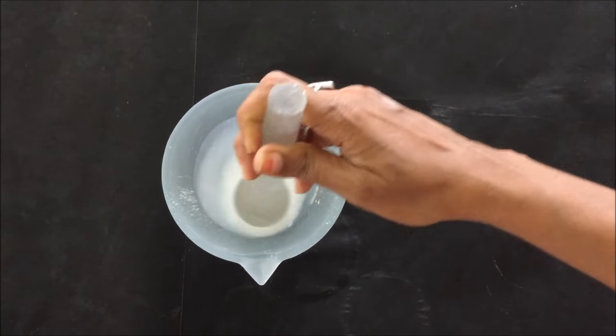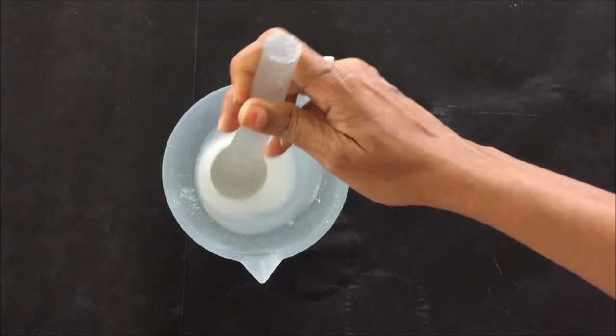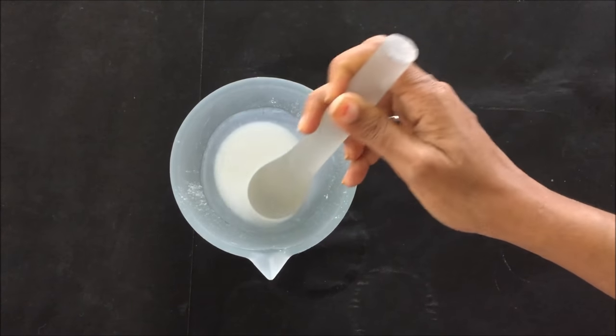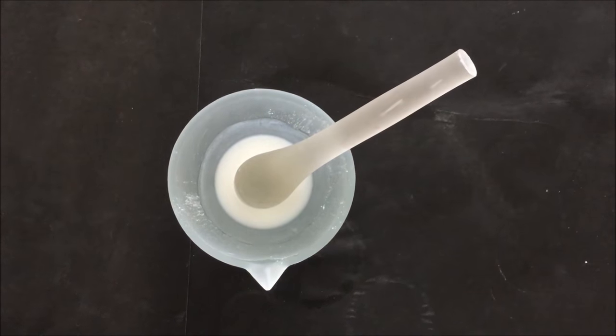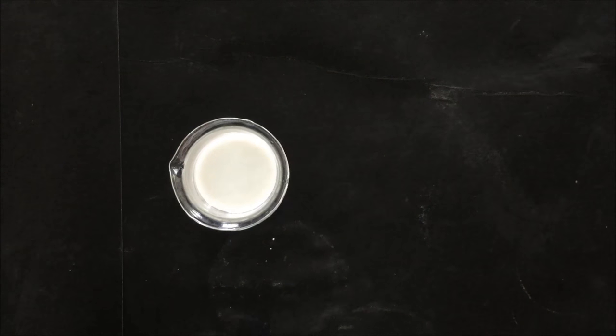Mix it properly to make sure that there are no lumps. Then after mixing, transfer the slurry into a clean dry beaker and by using a glass rod, make the slurry homogenous.